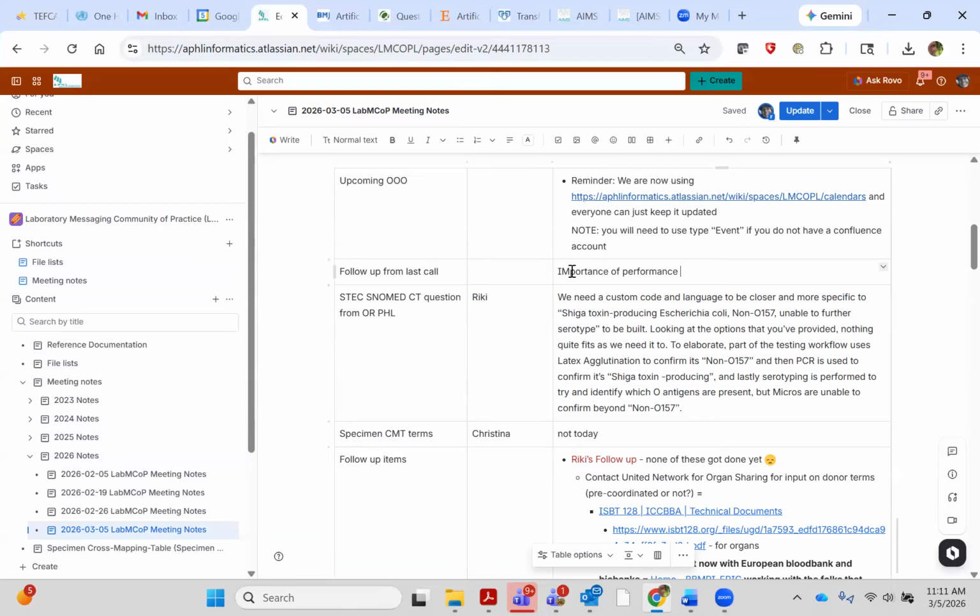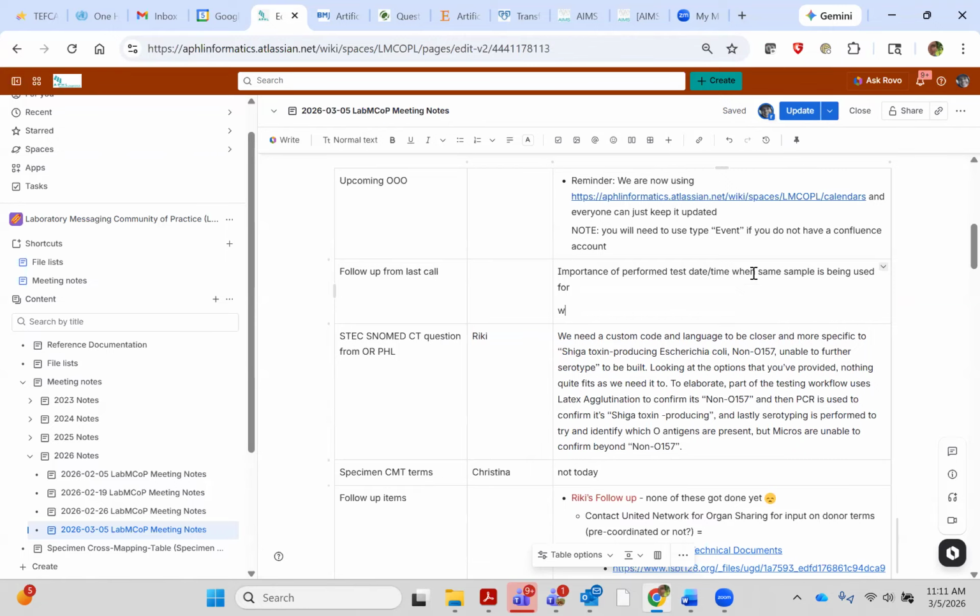But if you have two tubes of serum or plasma that were both collected at the same time and you combine them into the same aliquot tube, it wouldn't be specific to which tube. It would be, we have this specimen in the lab and enough to do the add-on test. We'll combine the tubes, or pull the serum or plasma off of the original tubes and put it in an aliquot, label it with the new add-on order, and then perform the testing.